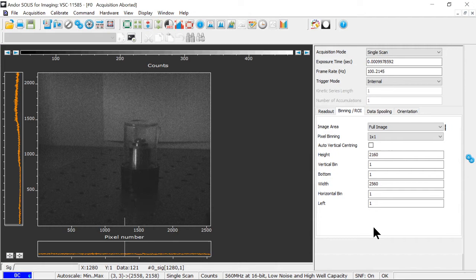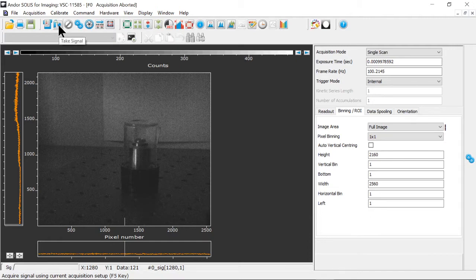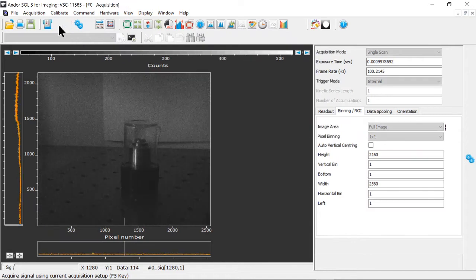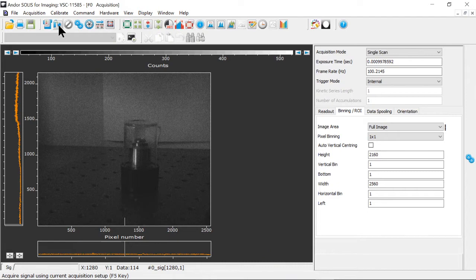So here I have a live video of an object on my desk that's illuminated, and I'm capturing images with an exposure time of one millisecond. You can see I've got quite a bit of noise, both shot noise and a little bit of readout noise. As I mentioned, readout noise is the noise in the image caused by reading the image off the sensor, as you might expect, as opposed to dark noise, shot noise and so on. We'll cover noise sources more in depth in a later video.